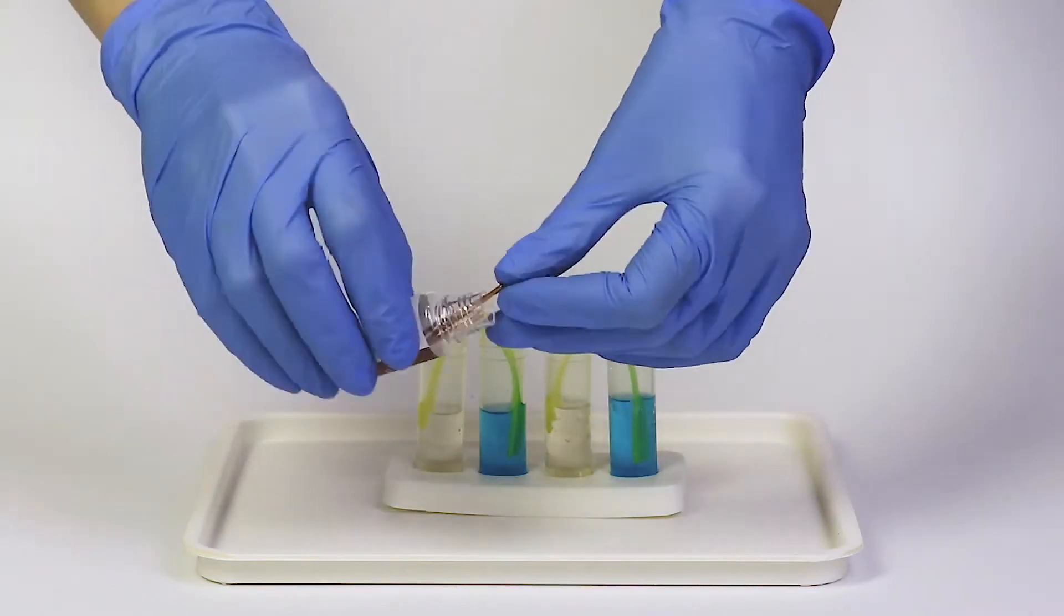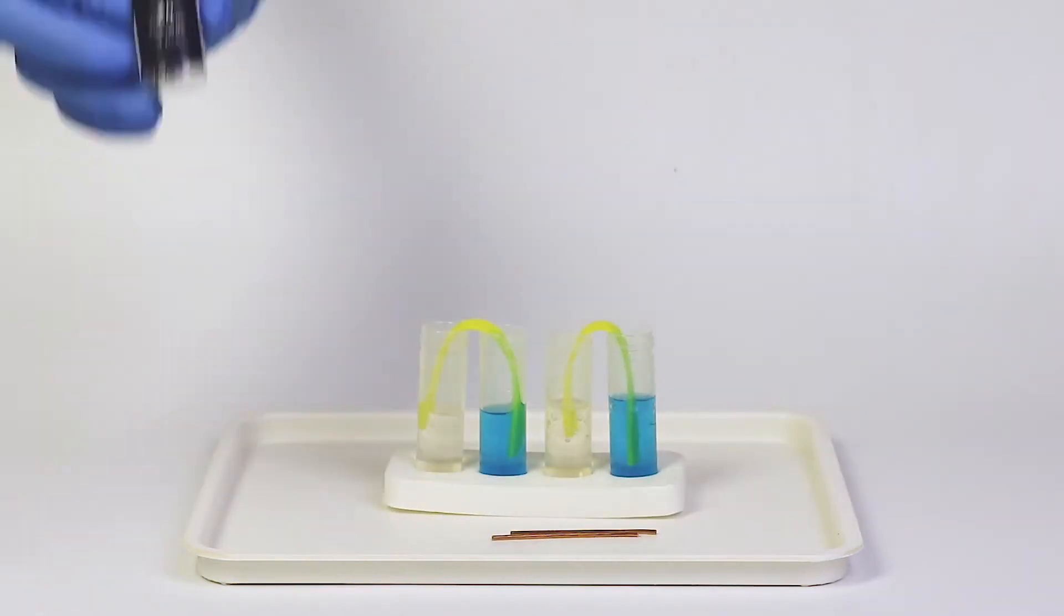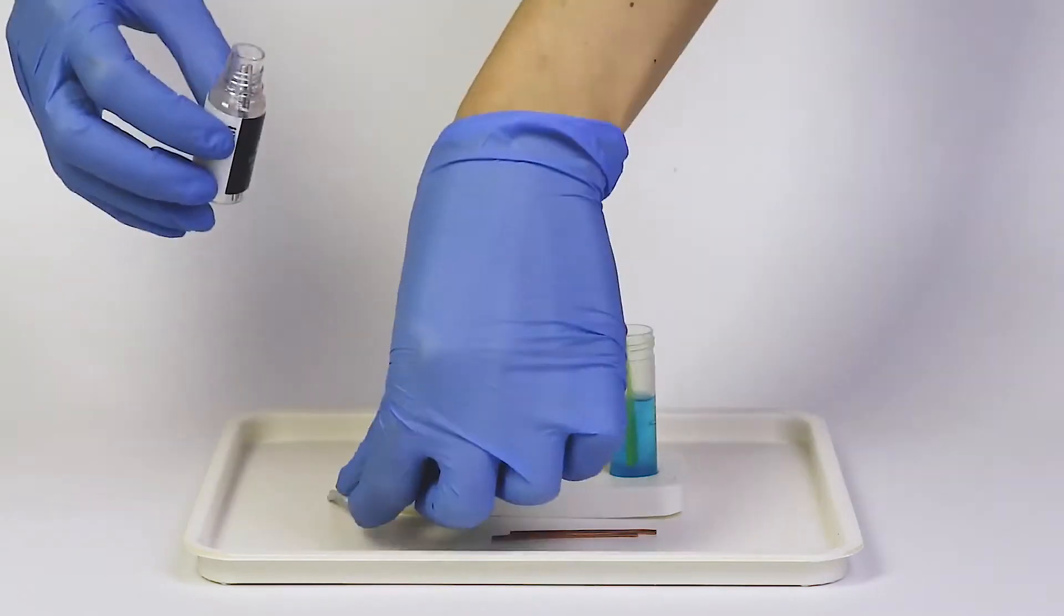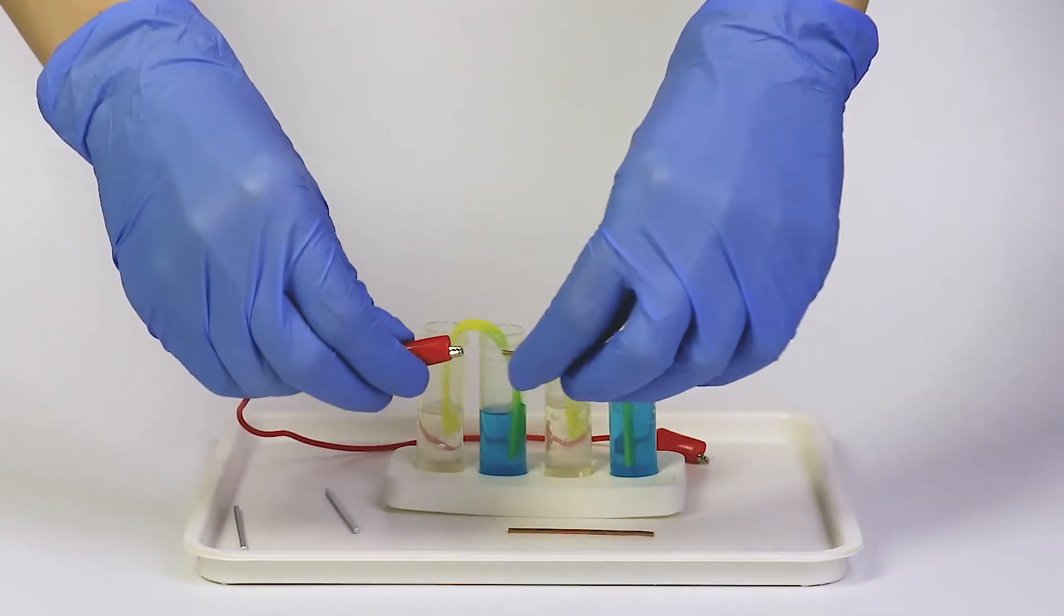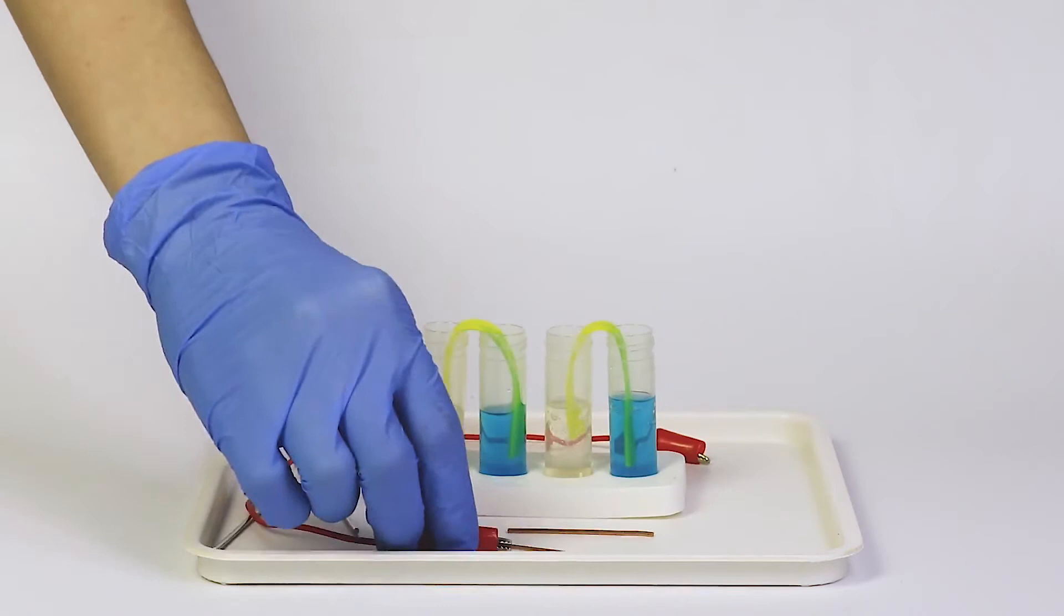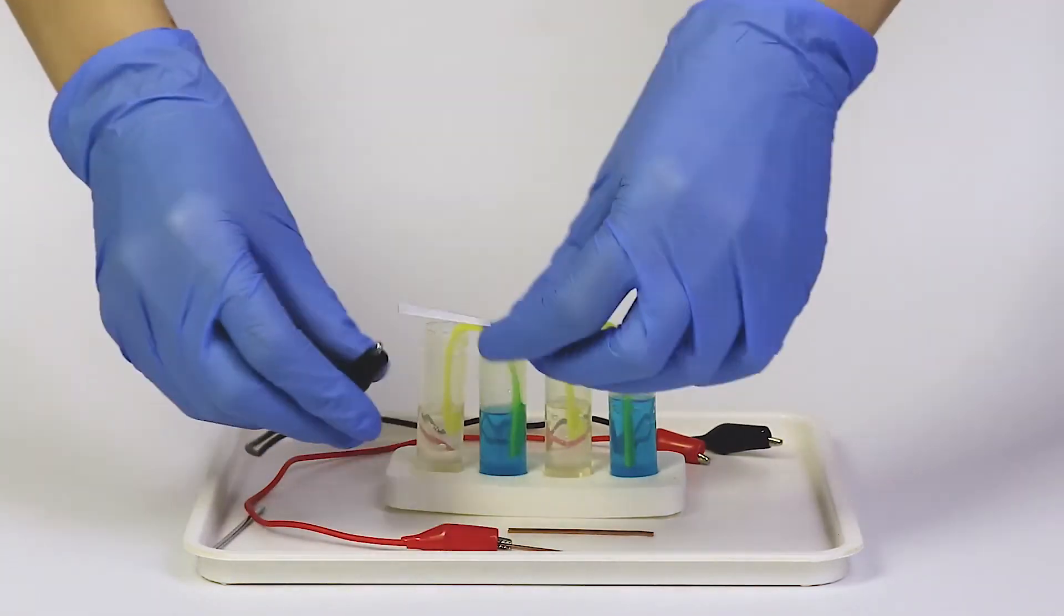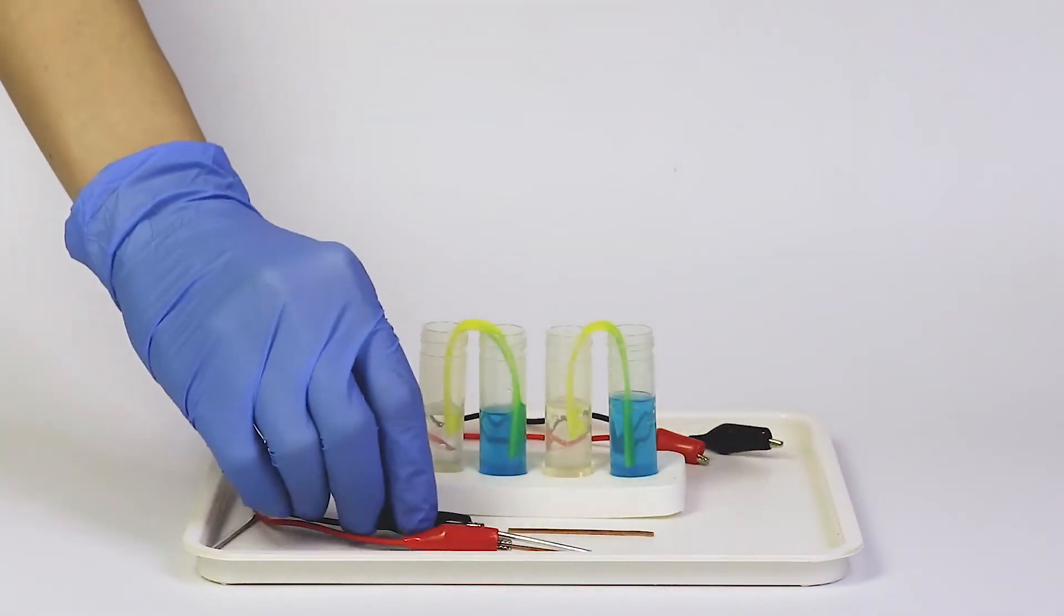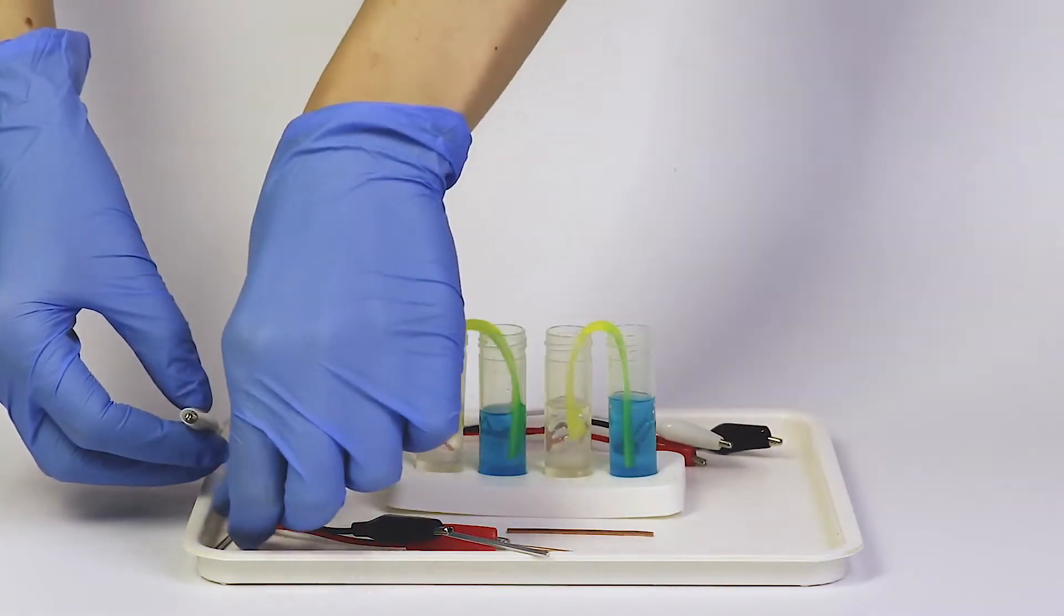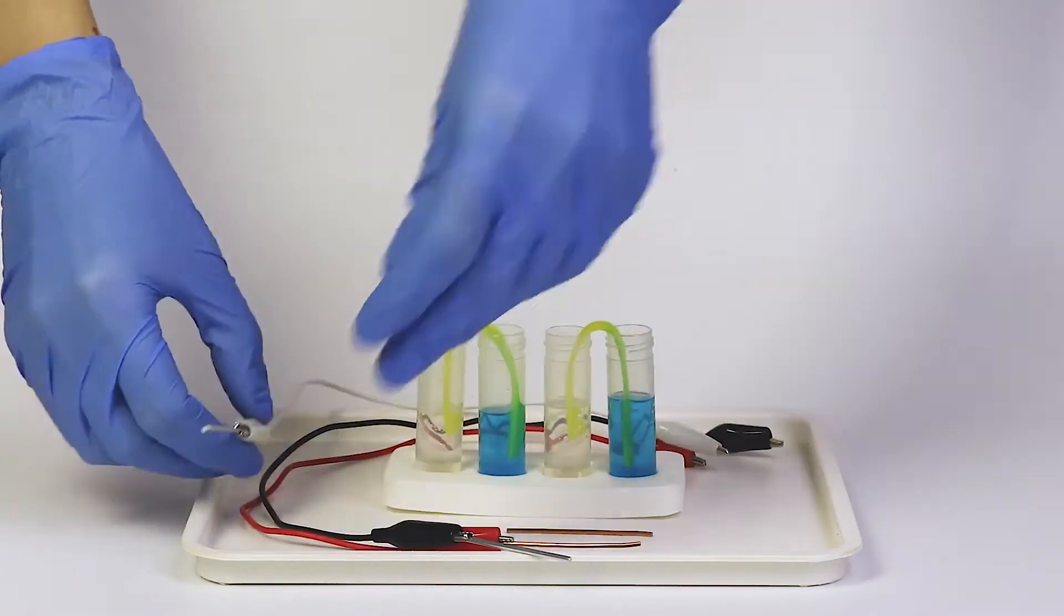Now, take two copper rods and two zinc rods. Connect one copper rod to the red wire and one zinc rod to the black wire. Then, take a white wire and connect it to the remaining copper and zinc pieces.